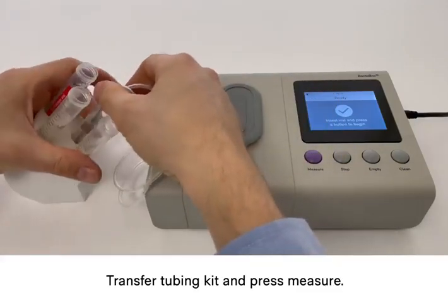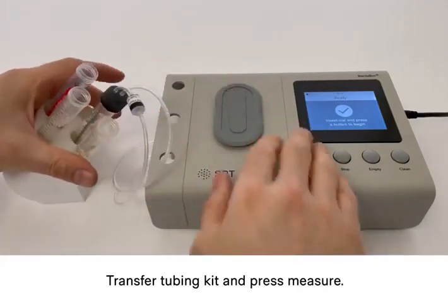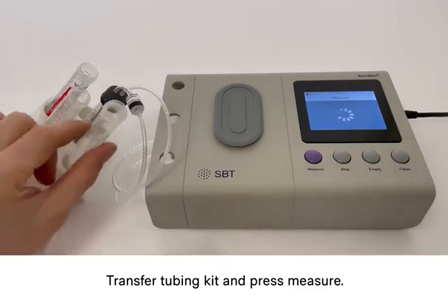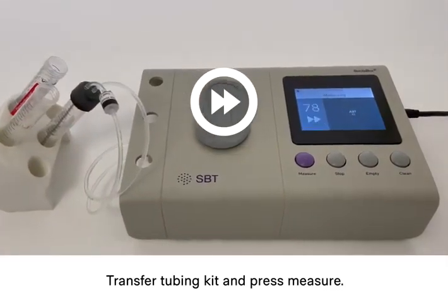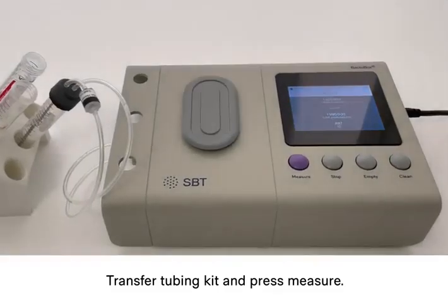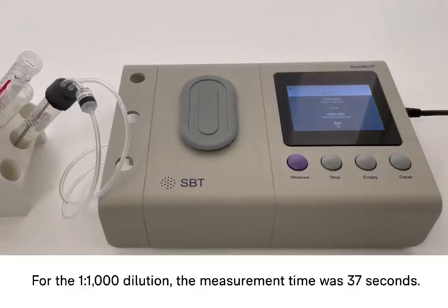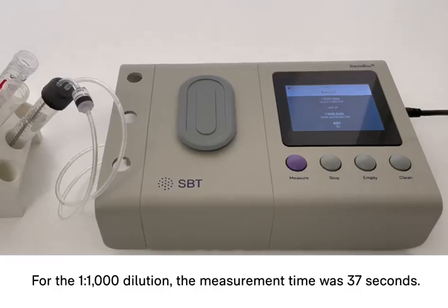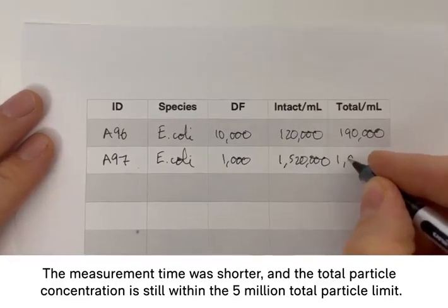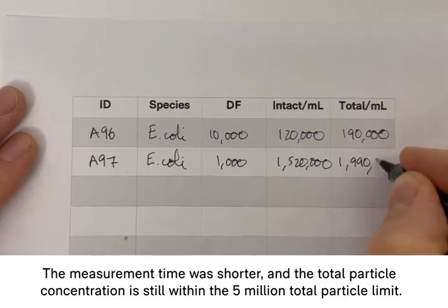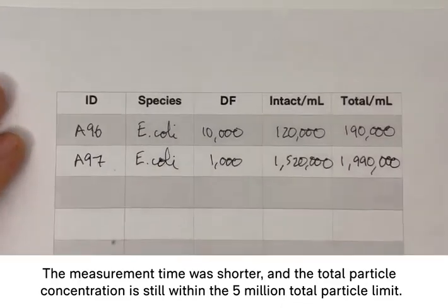We're not doing a clean in between because the carryover is negligible when moving to a higher concentration of bacteria. So simply transfer the tubing kit and press measure. For the 1 to 1,000 dilution, the measurement time was 37 seconds. This measurement took much shorter time and the total particle concentration is still within the 5 million total particle limit.